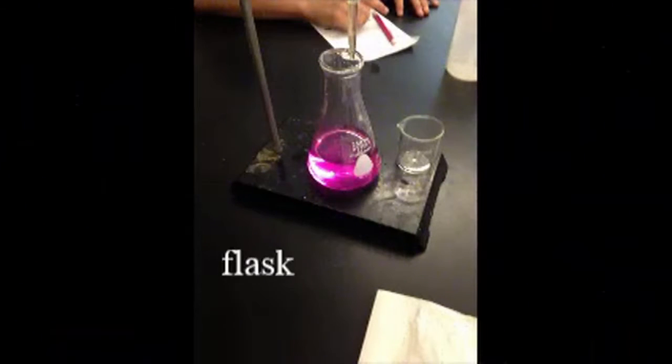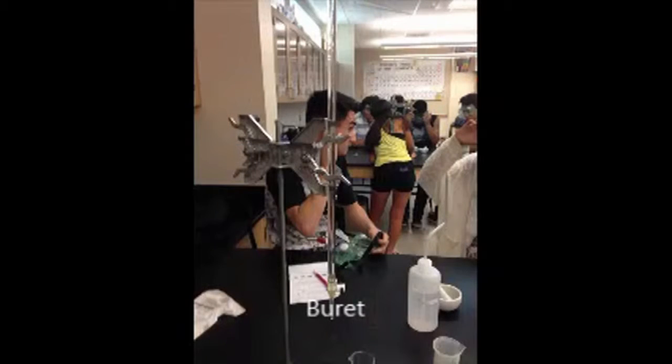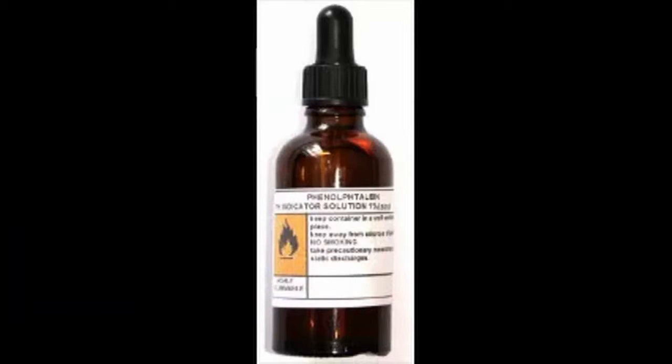The materials we used were a flask, a meniscus, and a burette. We also used vinegar, NaOH, H2O, and an acid indicator.